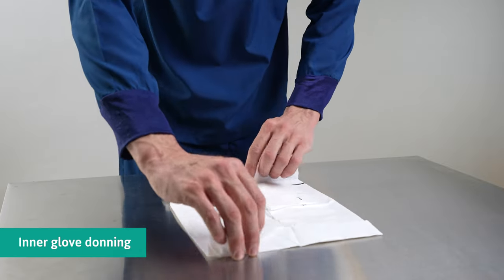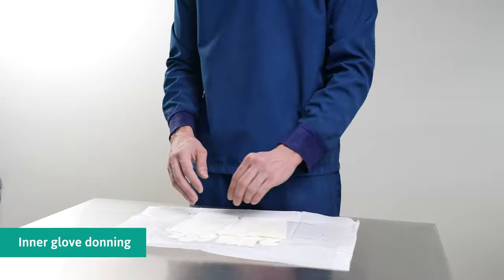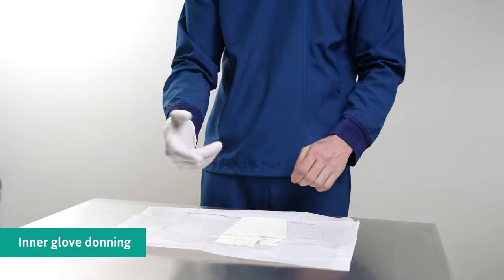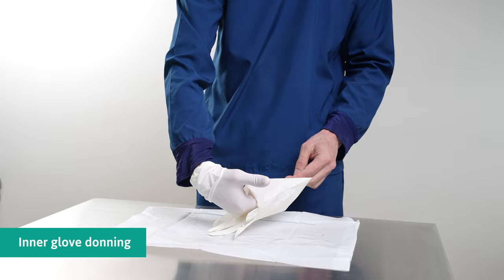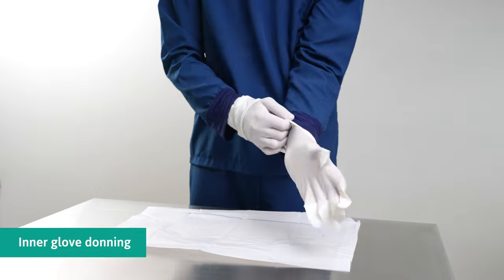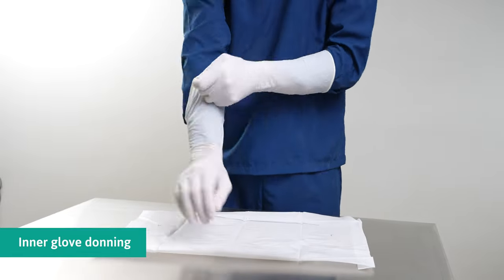When donning, avoid bare hands touching the external surface of the gloves. Grip firmly at the folded cuff and slide the other hand into the glove. Pull the folded cuff towards the wrist. Slip the fingers of the gloved hand into the folded pocket of the folded cuff, slide the other hand into the glove, and unfold the cuff over the sleeve. Using the gloved hand, unfold the cuff until it overlaps the sleeve.